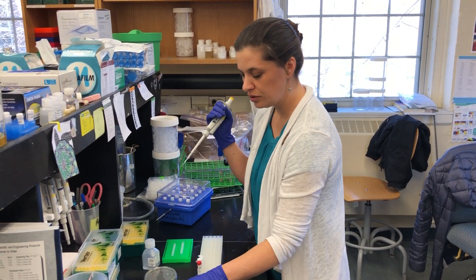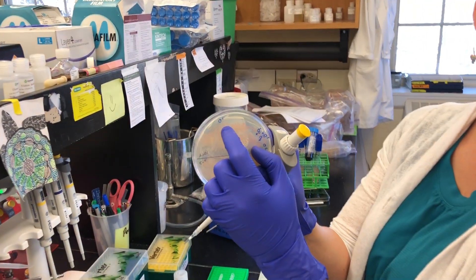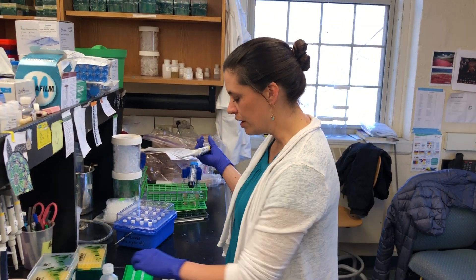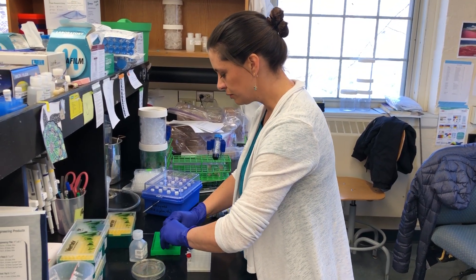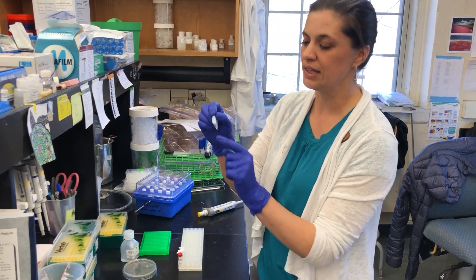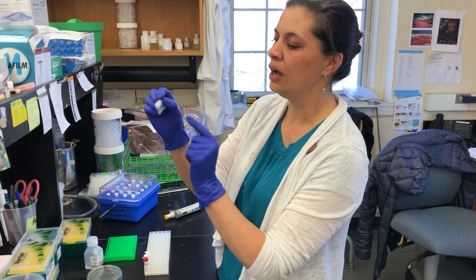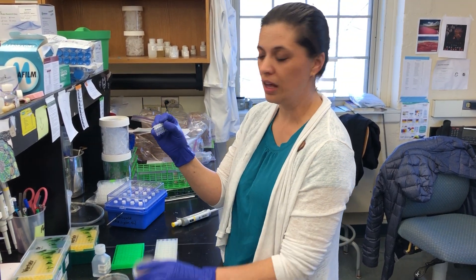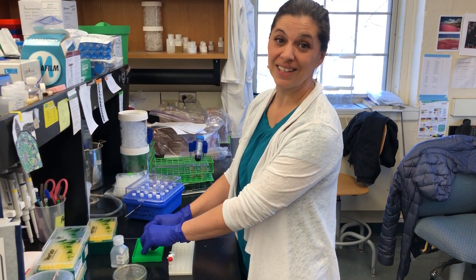I'll go ahead and do the rest of my colonies. You can see I've marked them with numbers so they don't get mixed up. Once I've got my DNA in there — since they're halophiles, they lyse in the PCR reaction and release their DNA. Once I've got a sample in there from each of the separate colonies, just pop it into the PCR machine, normal PCR. Done. Visualize on the gel. And that's it.